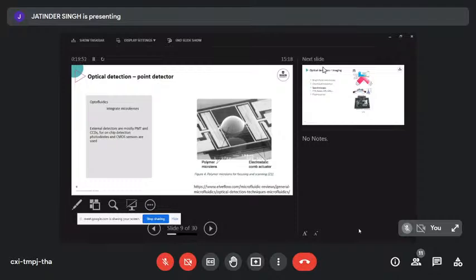So optical fibers, micro lenses, whispering gallery resonators, whatever they do, they all can be integrated in microfluidic structures. There's a lot of optical components that are being microfabricated. Their materials are really cool, really close to what can be done with microfluidics. So it's kind of a natural match.